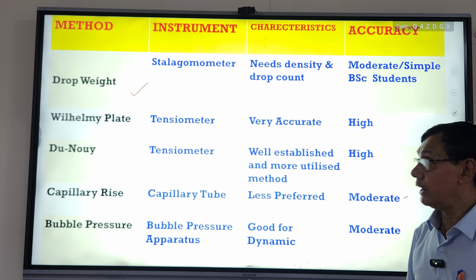And I am really grateful to the DST FIST, Government of India. We purchased this instrument, so I am grateful to the Department of Science and Technology FIST. Another method, the Wilhelmy plate method, is also there, and it is also very accurate. You can calculate, but today I will discuss the Du Noüy tensiometer method.